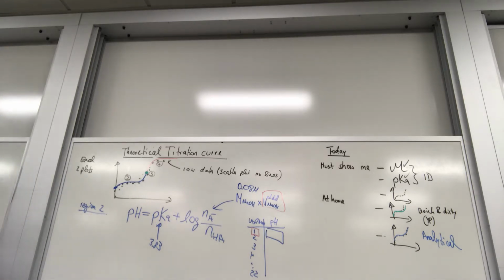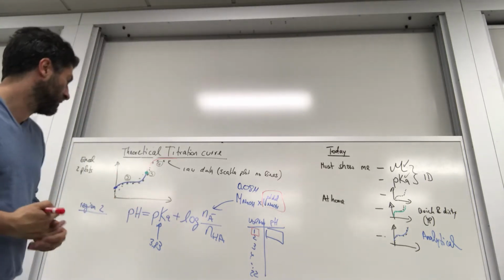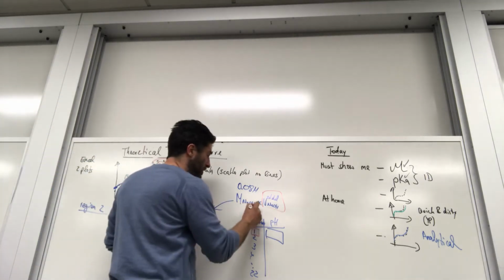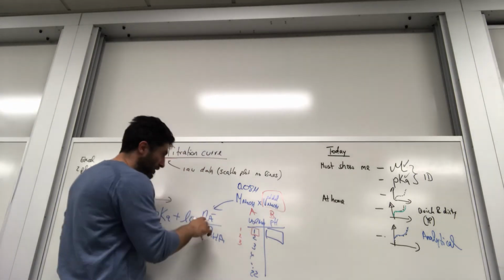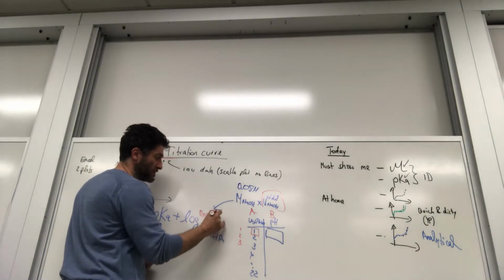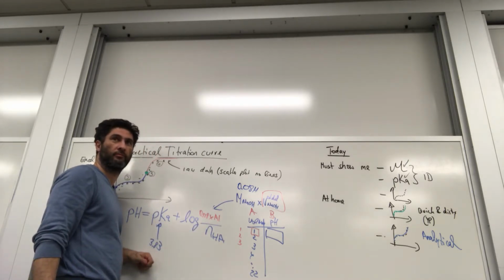In the pH equation, would it have to be a different equation? I'm not done with the equation, I just put the moles of NaOH. If this would be A, and this would be B, and this would be 1, 2, 3, then this would be 0.08, whatever the number is, times A1. Right?